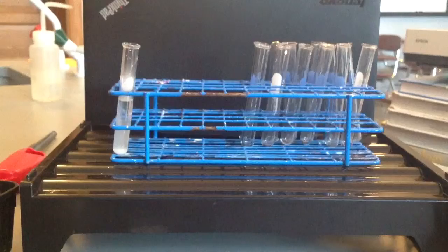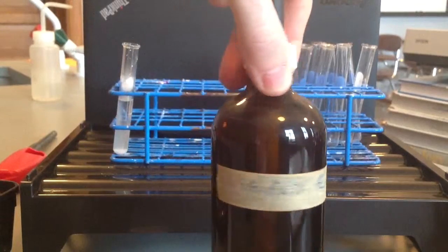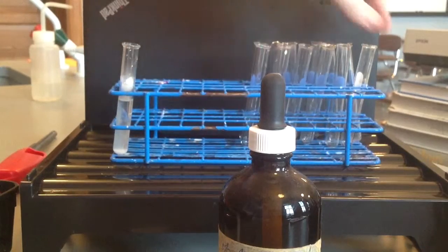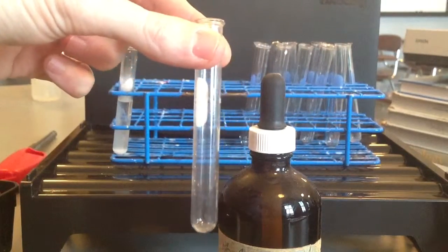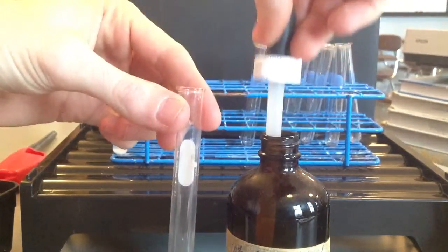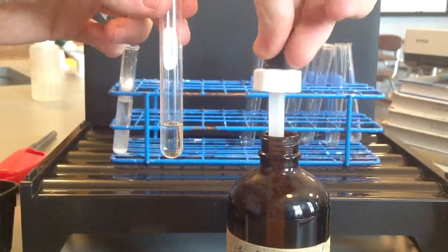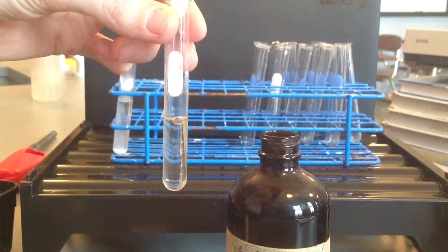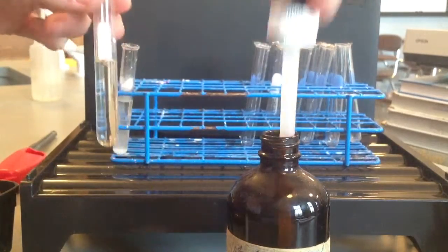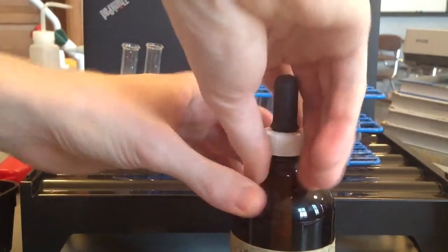So I'll go ahead and grab the acetic acid, which is here. Acetic acid, or otherwise known as household vinegar. Household vinegar is actually 5%, this is 10%, so it's a little stronger, but still going to do what we needed to do. So I'm going to take some and put it in the test tube. Okay, that's the acetic acid.